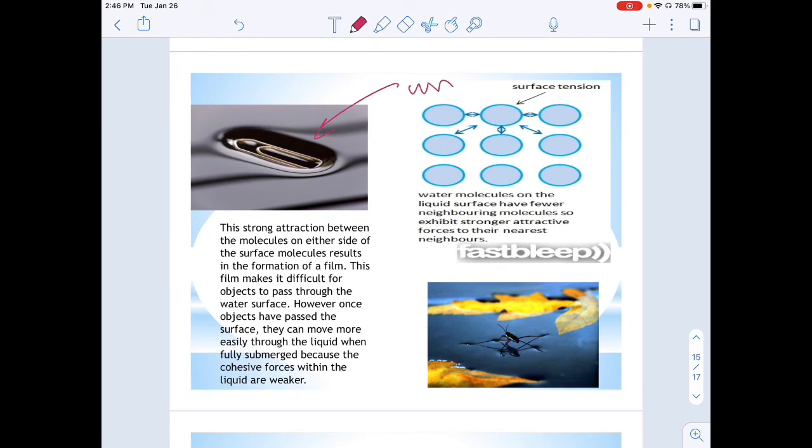Station 7, kind of cool. This is water. Water has very high surface tension. That's why it hurts when you belly flop. You have to break through those bonds. I like to think about the old school game Red Rover. Red Rover, let Johnny come over. And Johnny tries to run through, and it depends who you're playing that game of Red Rover with. Very strong people, it's going to be very difficult to get through. Very weak people, you can run right through it. Water is considered a game full of strong people. It holds that paperclip on the surface. Cyclohexane does not hold the paperclip.